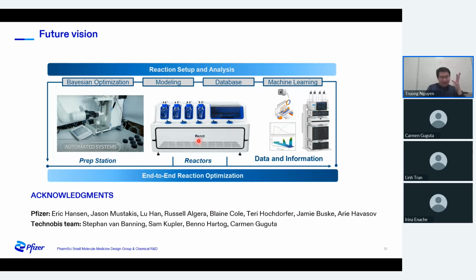We think that if we have a preparation desk with a robot that handles liquid and solid dosing, then picks the reaction to the reactor, and then runs LC or direct LC, using available AI ML Bayesian optimization to suggest the next experiment, and then keeps looping until we have a satisfied result. That's the ultimate goal. We're not there yet, but that's what we are trying to develop.